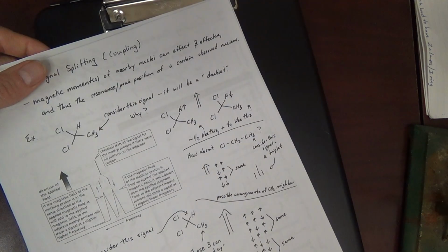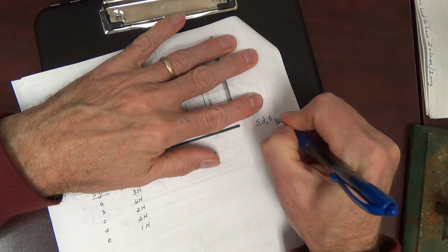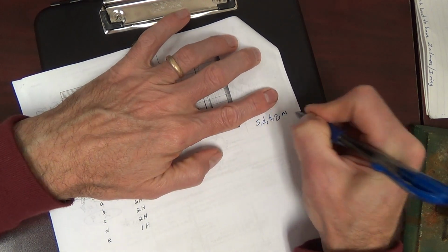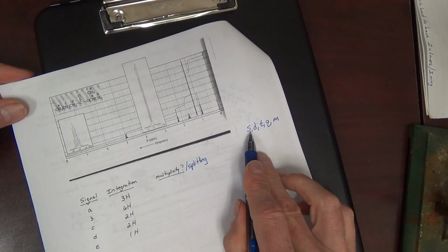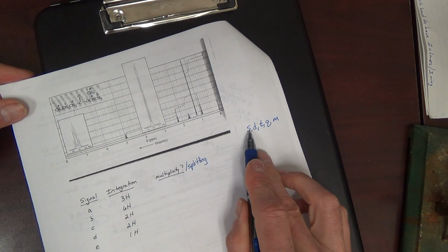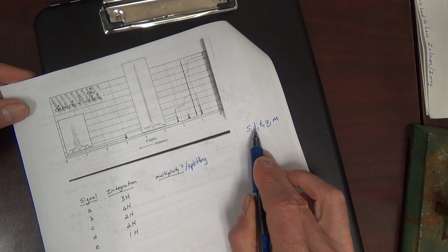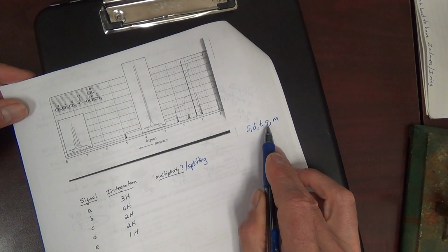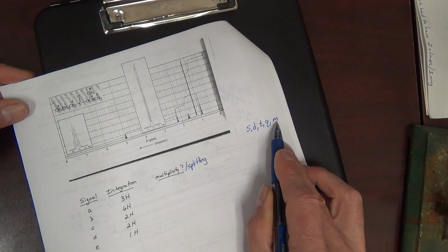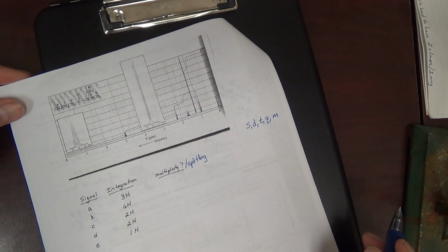As we move ahead, we'll learn that signals can be singlets, doublets, triplets, quartets, or multiplets. They can be not split, just one line, split into 2 lines, doublet, split into 3 lines, triplet, split into 4 lines, quartet. If it's more than 4 lines, we typically call it a multiplet. Okay? What type of splitting would you expect?